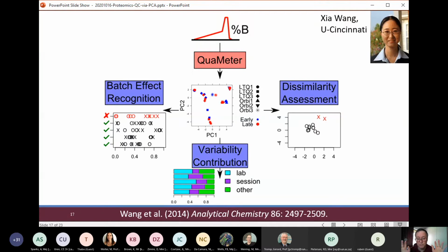This can create a huge problem because now the biology of how these two samples are different from each other is competing with differences in how the instrument is feeling between this time and that time. And we found things as simple as, are they painting the hallway outside, can actually play a really big role in affecting the mass spectrometry data that we produce. You might think, well, gosh, I'm glad I don't use a mass spec. I'm a sequencing person. But the reality is sequencers also have good days and bad days. Batch effects are a real thing.